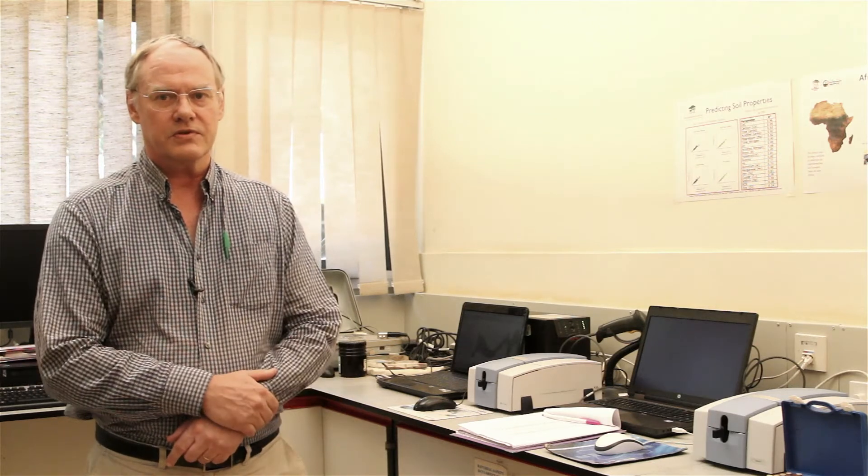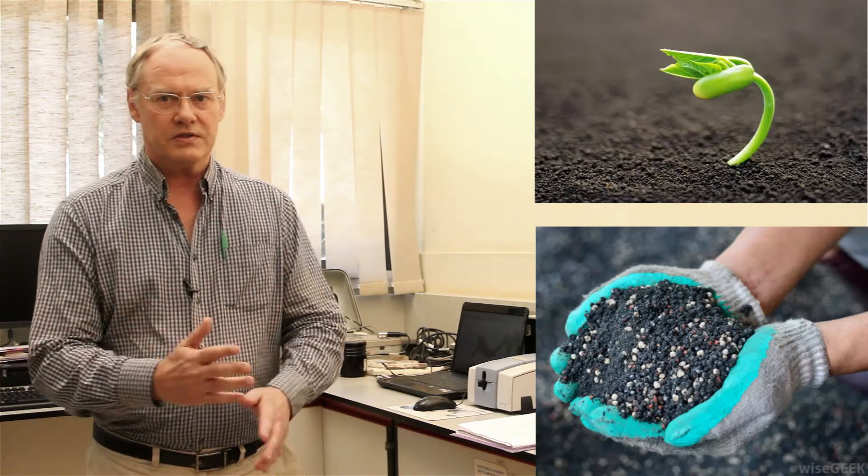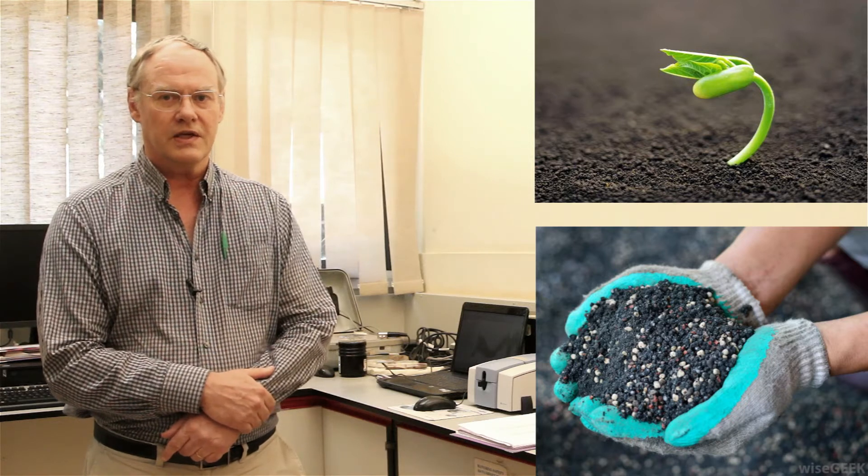This equipment enables us to take multiple georeferenced observations of soils and plants across landscapes, which allows us to create digital soil maps of properties. We can provide these maps for free to farmers and to the private sector — for example, fertilizer companies — to allow them to make much more accurate recommendations. We can also map plant responses to fertilizers and plant nutrition at that scale.